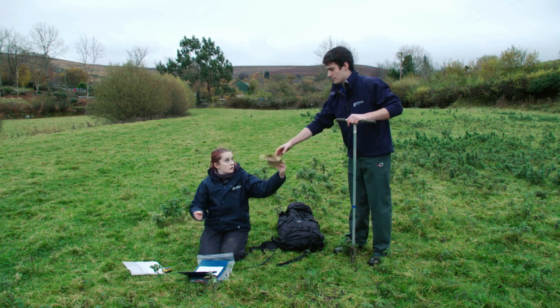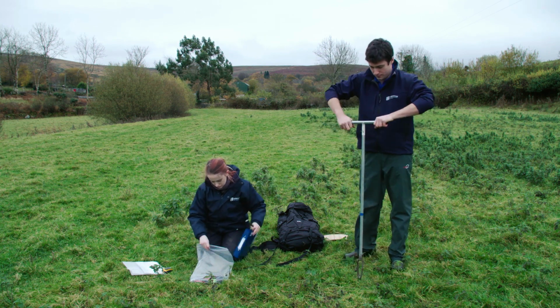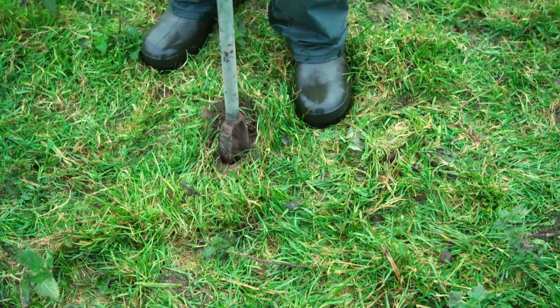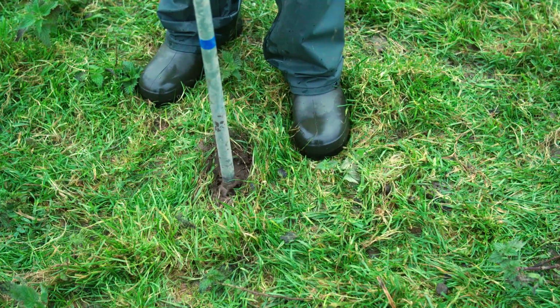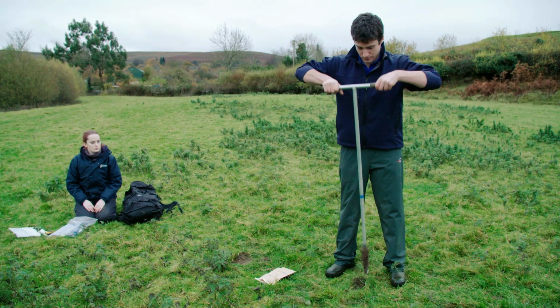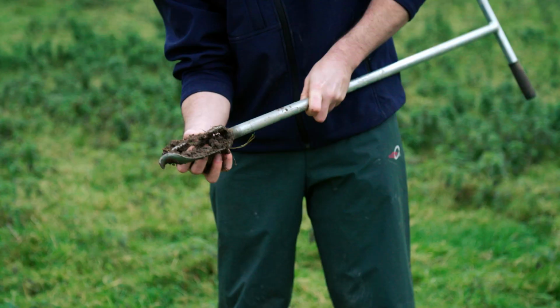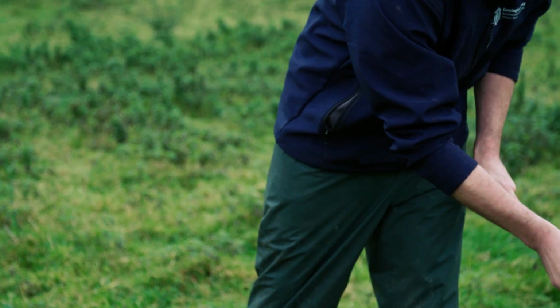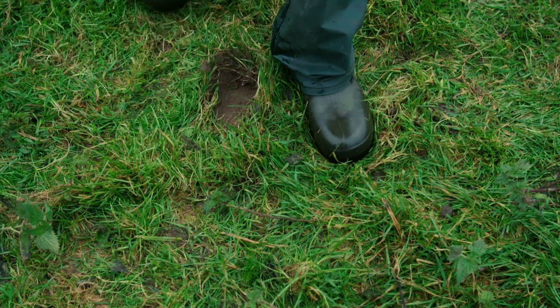Before collecting any samples, the auger must be used once to remove material from any previous site and to pre-contaminate ahead of sampling at this site. Collect one full auger flight of material and discard this material. Kick away the top rootlet or leaf litter zone before inserting the auger.